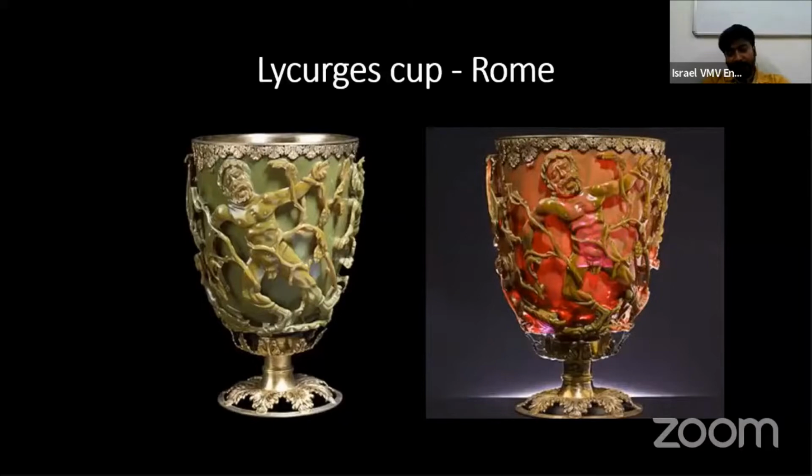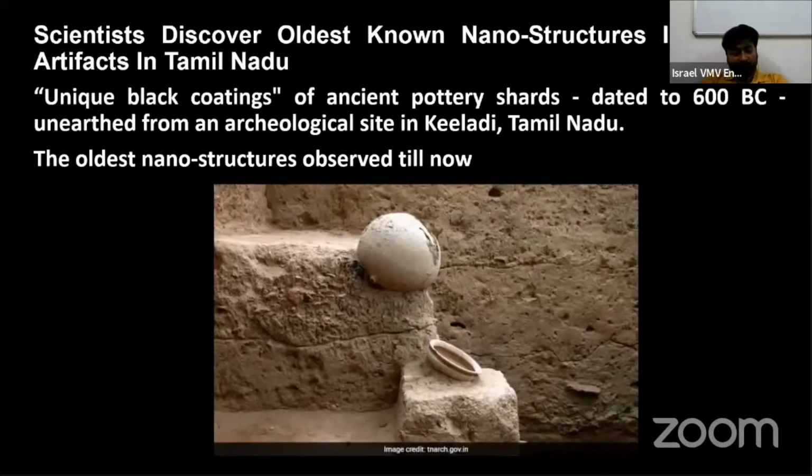And to analyze them, we need spectroscopic tools and imaging tools. One thing one should know is the analysis is mainly through imaging techniques like atomic force microscopy, scanning tunneling microscopy. These are all tools to see them directly and find out particles at the nanometer scale. But you can still use spectroscopic methods to analyze them. That is the theme of our discussion today.